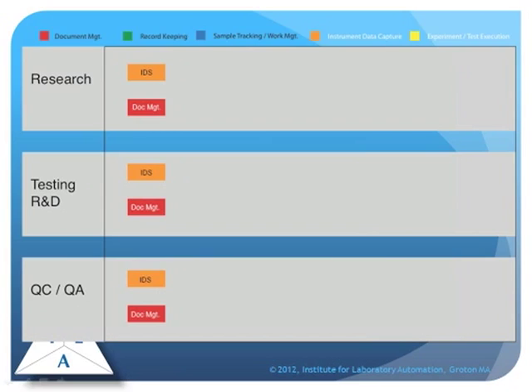And like document management systems, they're fairly general. They can be used in any application, and actually today, for the most part, people buy the instrument and the computer system together as one package and don't even think about the fact that there's a distinction. They're really dealing with different things, one working in the analog world and one in the digital world. If you want to do a bidder evaluation, you can decide what kind of instrumentation you want to deal with and then pick data systems that are better suited to your type of application.